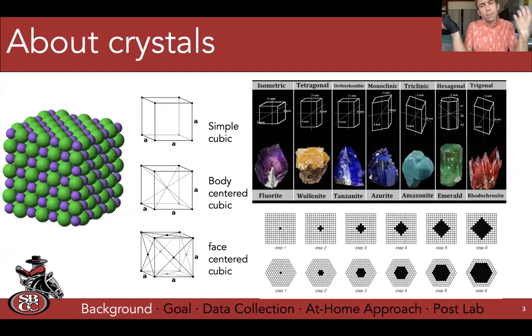You're going to say, later on, I'm going to show you a video of crystals just growing kind of randomly in a jar. And you say, well, where's the nucleation site there? Scratches in your glass can work as a nucleation site. Small pieces of dust can act as a nucleation site, although they're not ideal nucleation sites because it's very unlikely that the nucleation shape is going to be exactly the shape of the unit cell. And that's what we want, is this perfect growth. So we are going to start with a nucleation site like this.